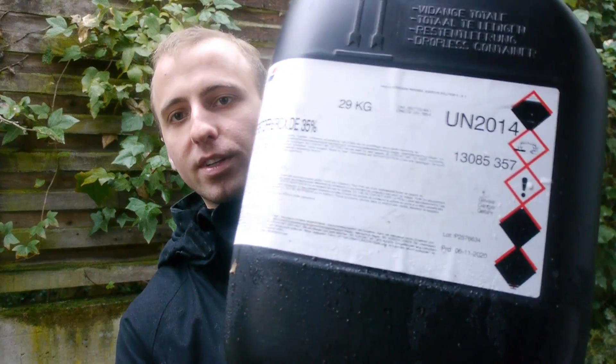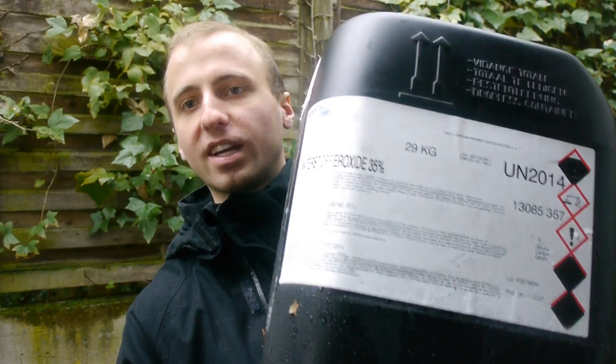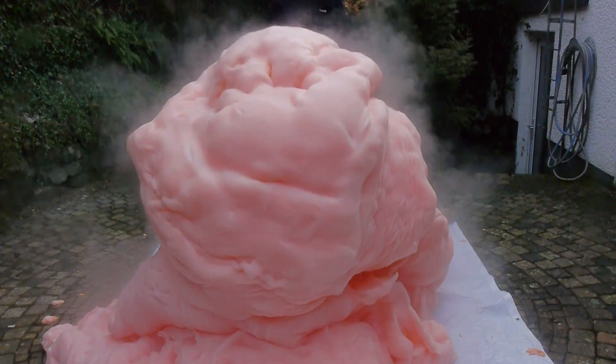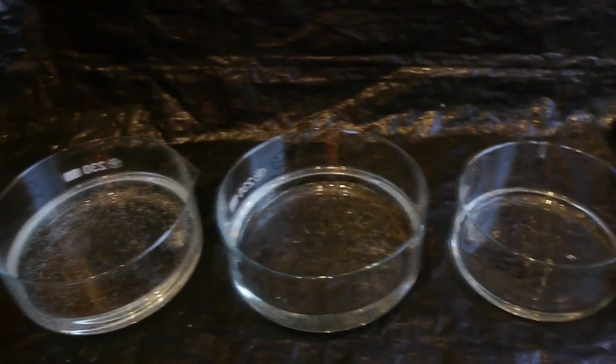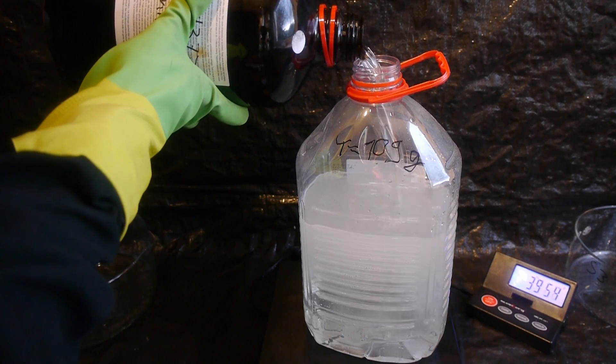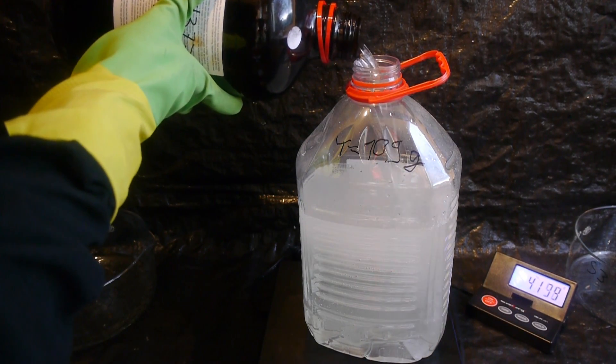Luckily, after I explained exactly what I planned on doing, one company actually sold me 25 liters of 35% hydrogen peroxide. This is however the concentration with which you can only make regular Elephant's Toothpaste. So in order to get higher-concentrated hydrogen peroxide I had to make it myself, which is actually relatively easy but expensive and time consuming.